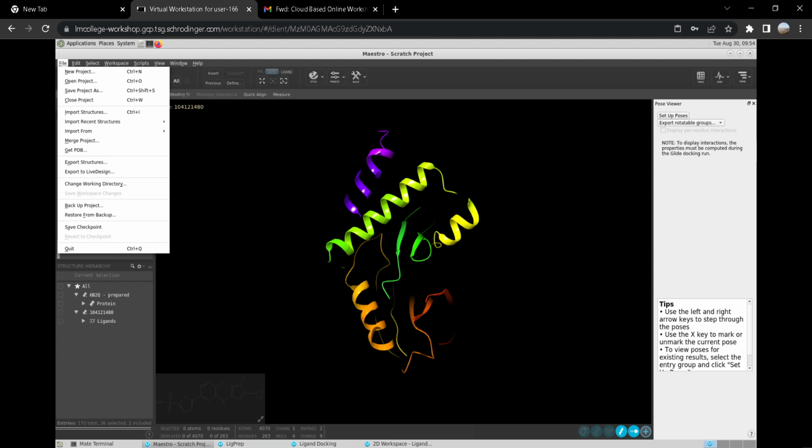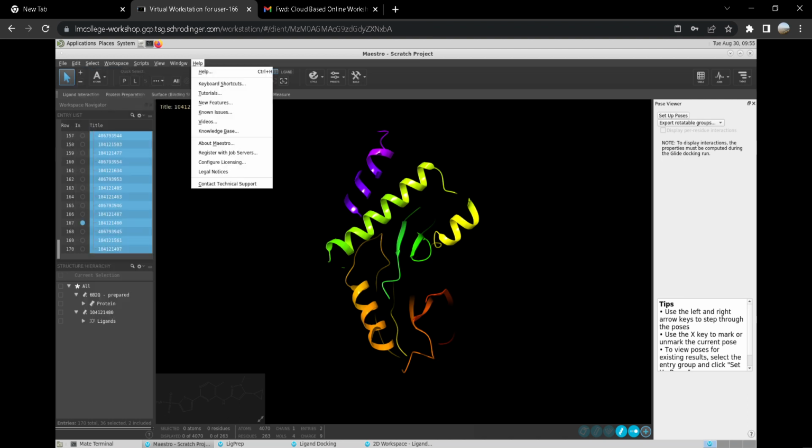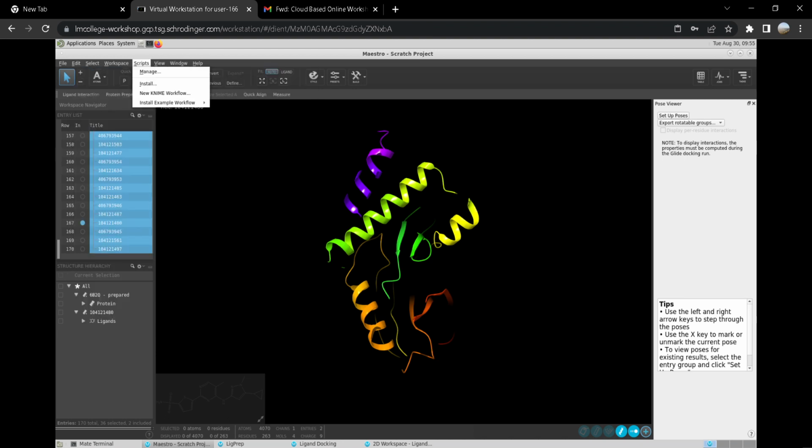The XYZ coordinate is also mentioned here. You can see this is the XYZ coordinate used during docking. And if you slightly drag to the right, we can see docking score and other scores. It's like an Excel bar. Because the system is quite slow, I'm facing difficulty in visualizing it and showing it to you.